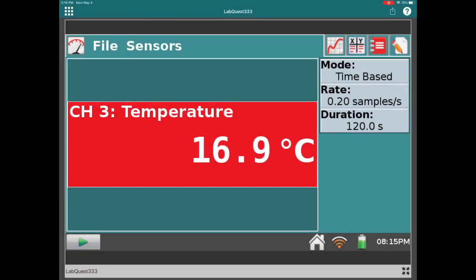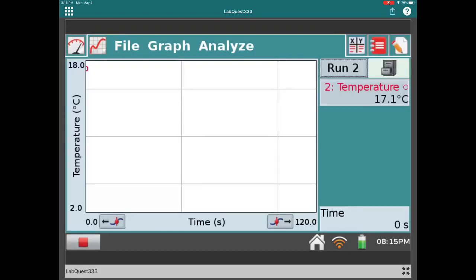Our next liquid is acetone. Acetone is also known as 2-propanone or propan-2-one using proper IUPAC nomenclature. Acetone is not an alcohol — it was used extensively in nail polish remover. Take a look online at its molecular formula and structure. We have a beaker with acetone, and the temperature probe with a small piece of filter paper wrapped around the tip of the sensor is sitting in the acetone with the temperature being recorded. We'll collect data, discard the previous data set, and record some initial temperature readings of the acetone sitting in the beaker.